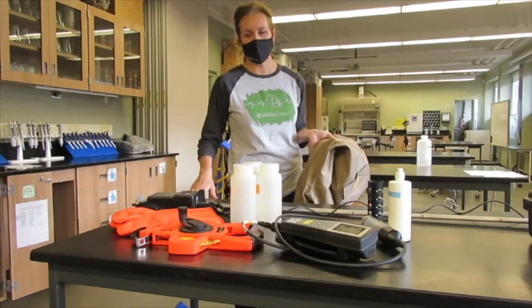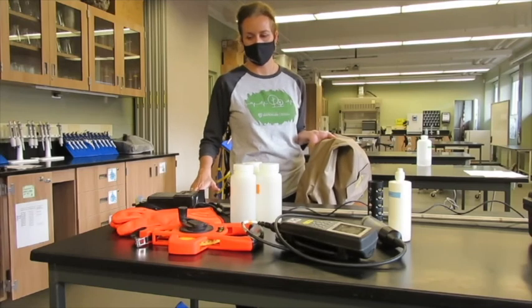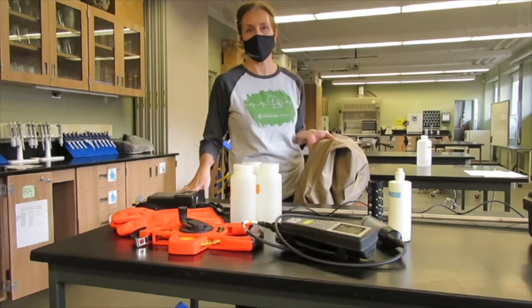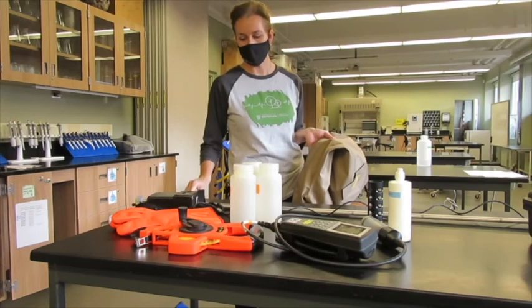Hi everyone, we're here in the Ecology Lab and what I have in front of me on the table is a variety of equipment that we use in stream sampling and assessing stream health.